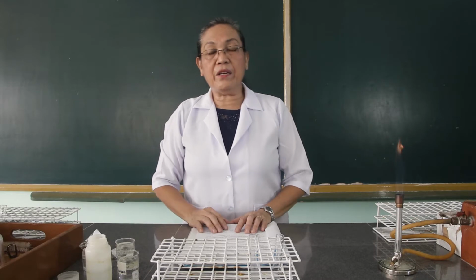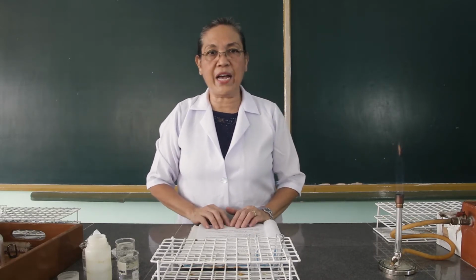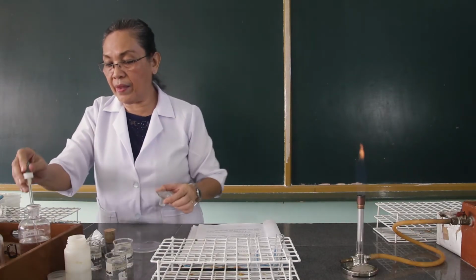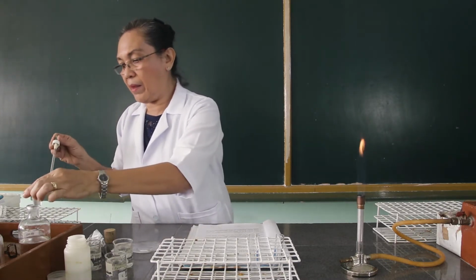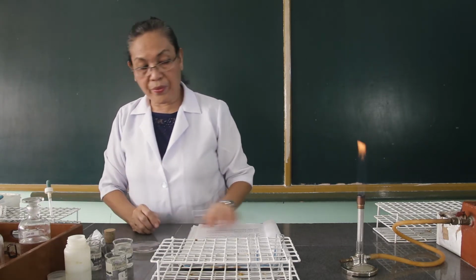Now the next procedure is to have a flame test of the magnesium ion. We will use here the magnesium chloride solution. Hydrochloric acid.